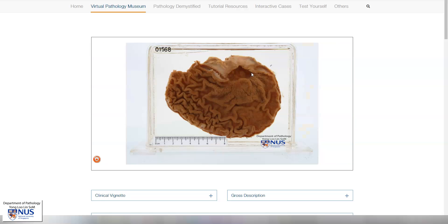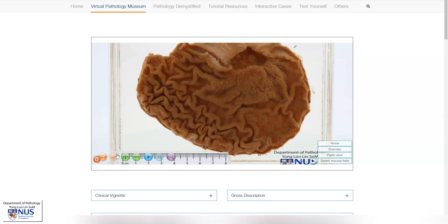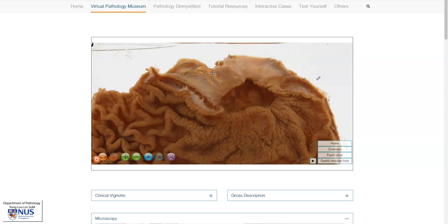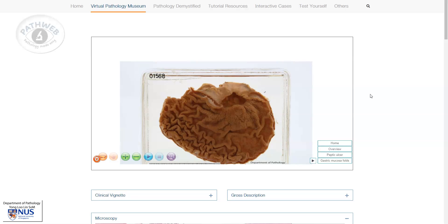Finally, here is another example. This ulcer is in the stomach, and we can see that it is again very punched out. Over here, the wall is markedly thickened by fibrosis. So this also shows us the chronic nature of this ulcer.